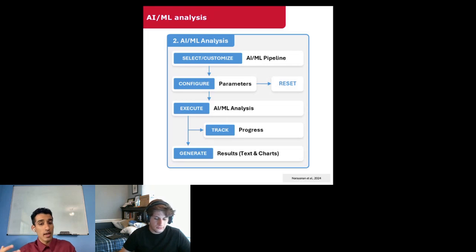What we wanted to emphasize with our interactive version of IntelliGenes is that it is consistent with our CLI tool in the sense that the results, as well as all the configuration options, are perfectly identical between the two tools. This is to ensure that the bioinformaticians using the command line tool or potentially the non-computational scientist using the GUI tool both have a similar experience and are both able to perform the same powerful analysis without compromising on any feature sets.